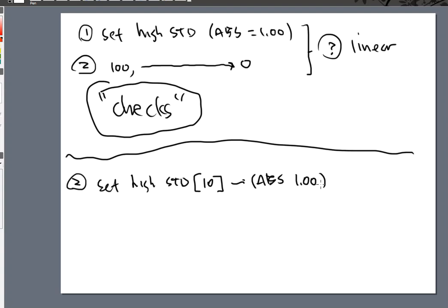So we're resetting the machine. The 10 gets pumped in. The detector looks at that 10, and it scales itself up or it scales itself down. And it says, I'm going to make this a 1 absorbance for you. So that way, if you have something a little bit greater than 10, not a big deal. Something lower than 10 is preferable. It will be lower than 1. That is our working range of the absorbance values.